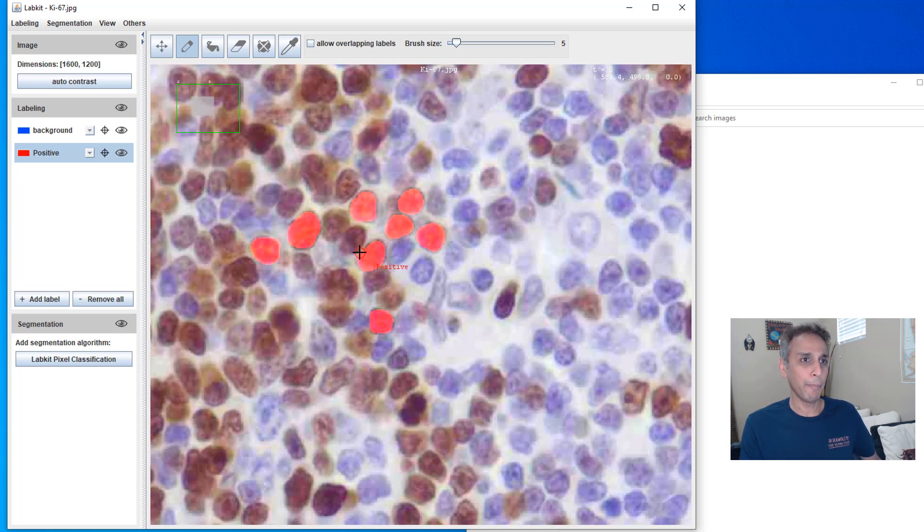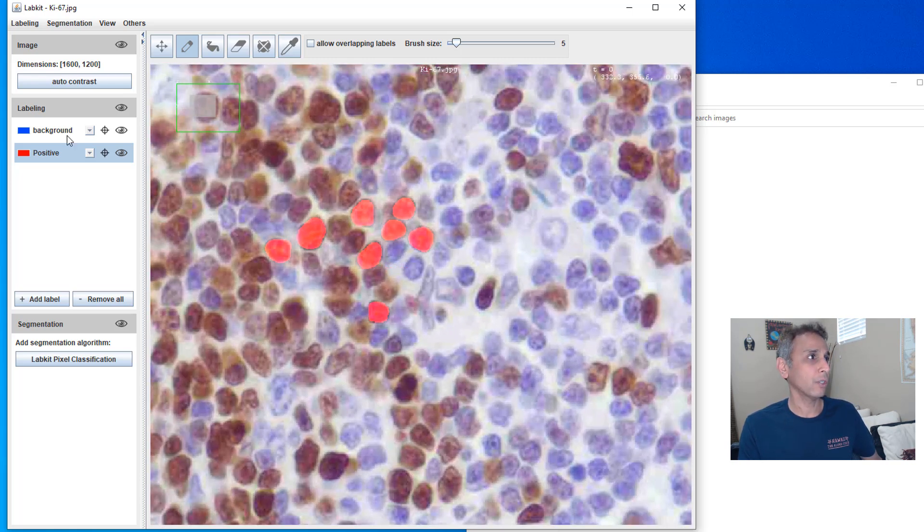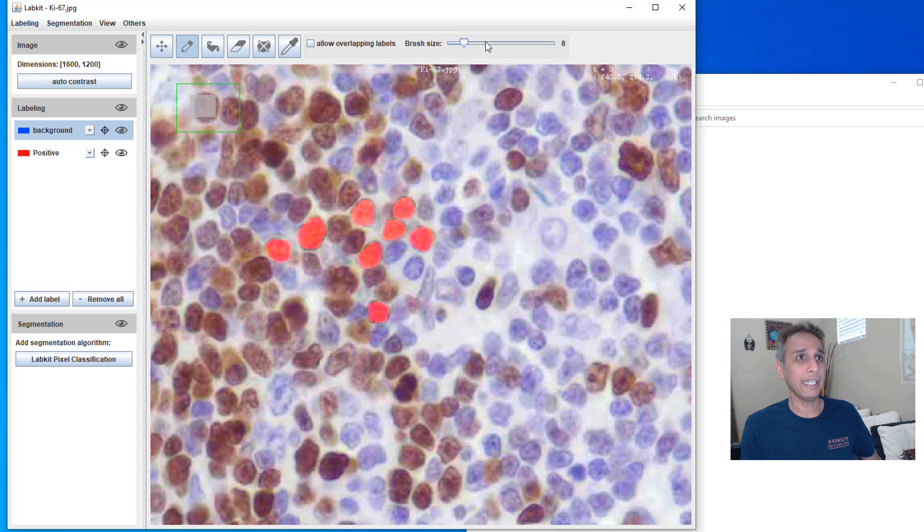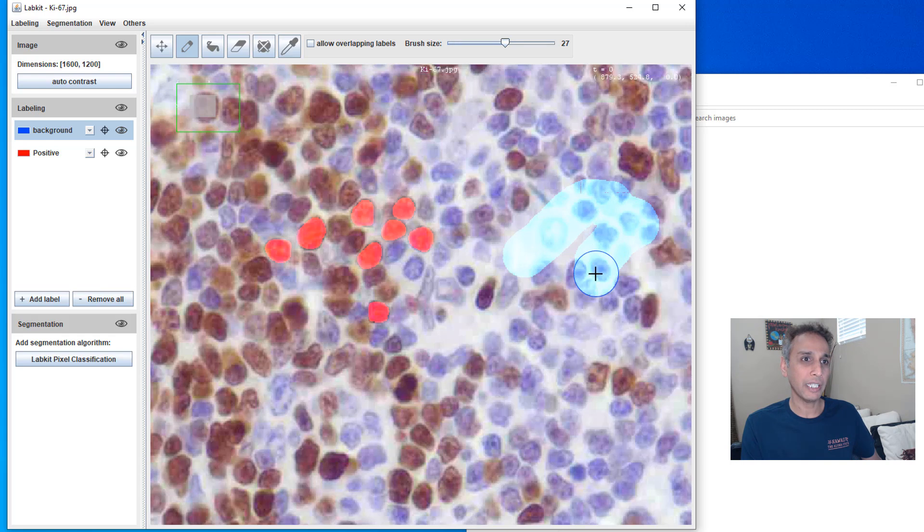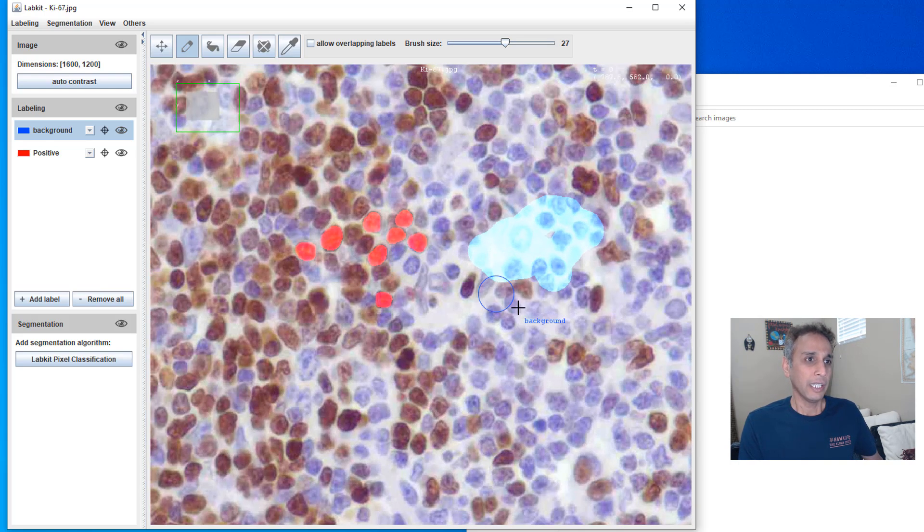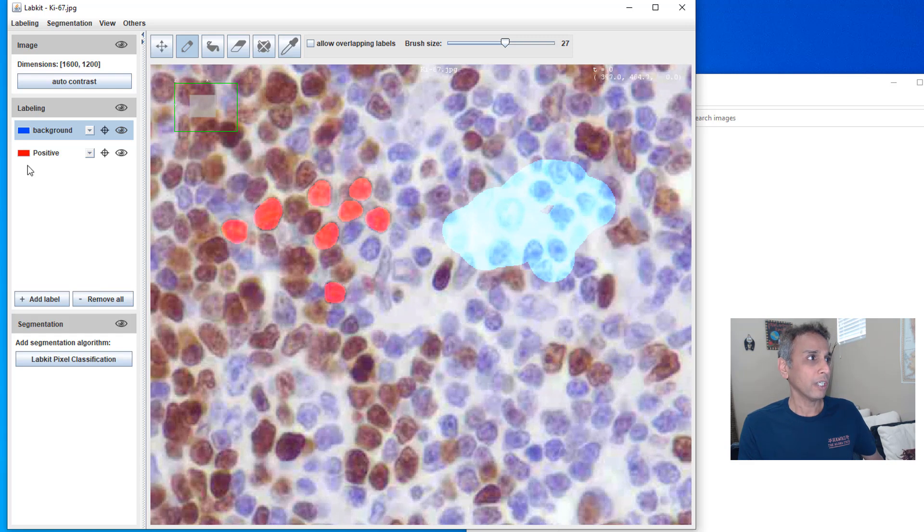You got the point, I think, but I'm doing this deliberately to add a few more for a good reason. You'll see why in a minute.